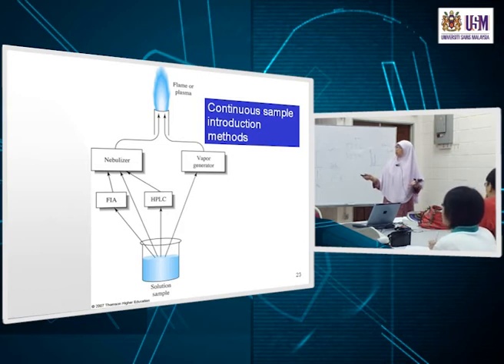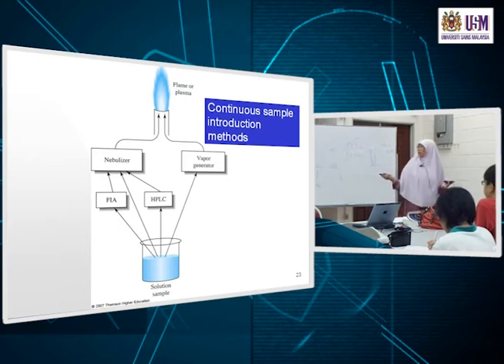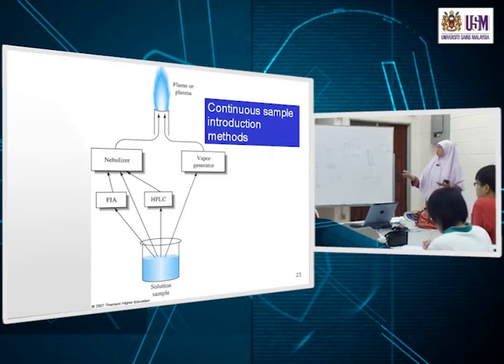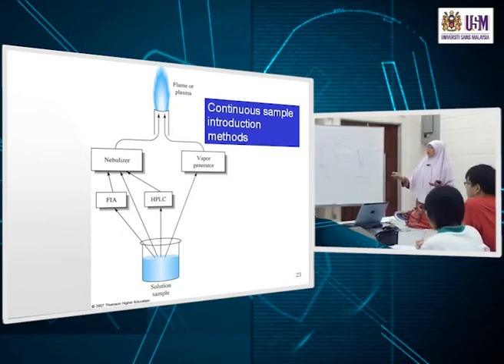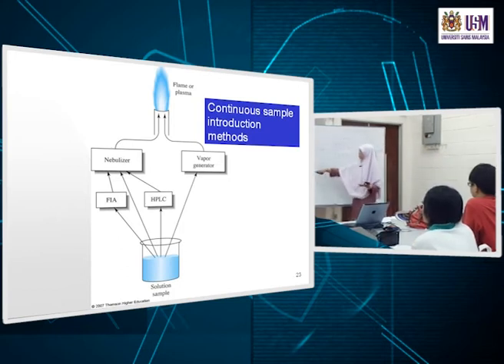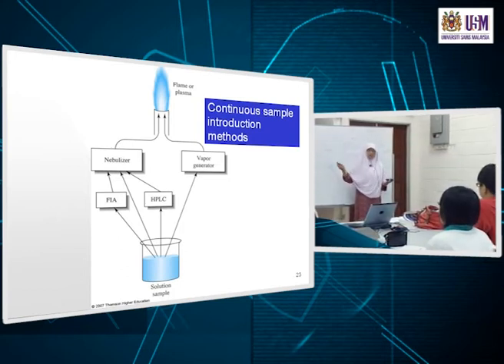In other words, understand, it comes from solvent. Solvent is what you put to dissolve something, okay? Desolvation means you get rid of the solvent. So you get rid of the solvent, the water, and it becomes some dry aerosol, your NaCl particles. This will then undergo volatilization to become a molecular vapor, and ultimately to become gaseous atoms. It's only these atoms which then the electron will be jumping from here to there, okay?